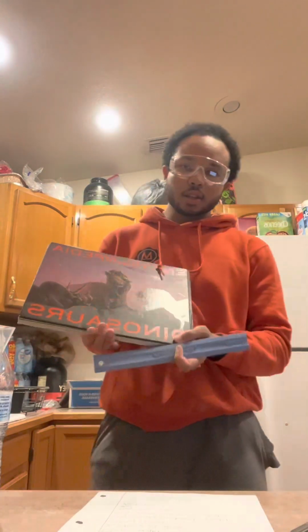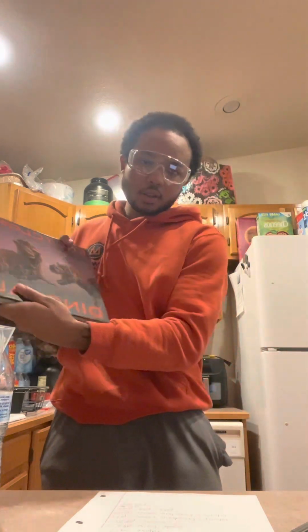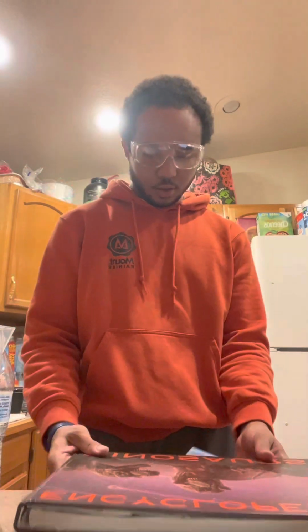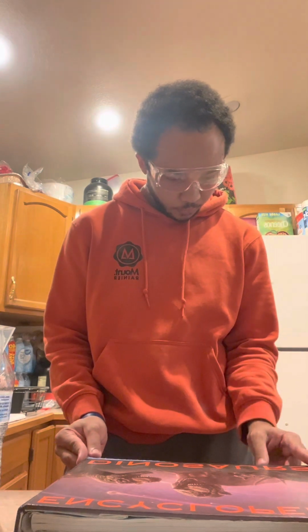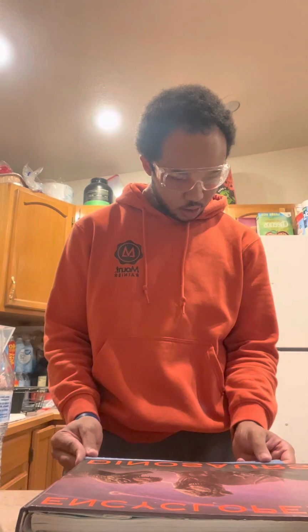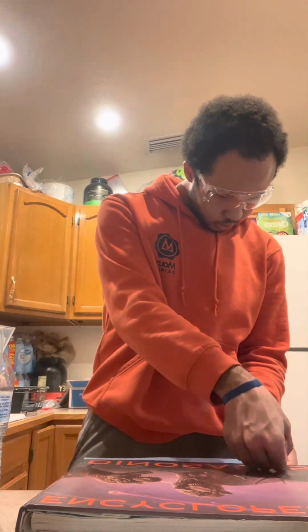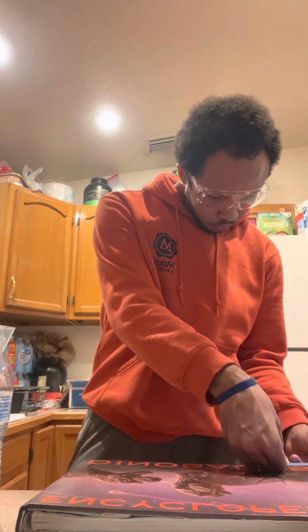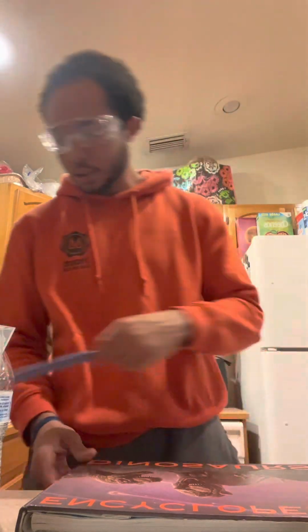So first, we're gonna take the width of the book. So we got 30 right there. Yep, looks about 35 centimeters on the dot.